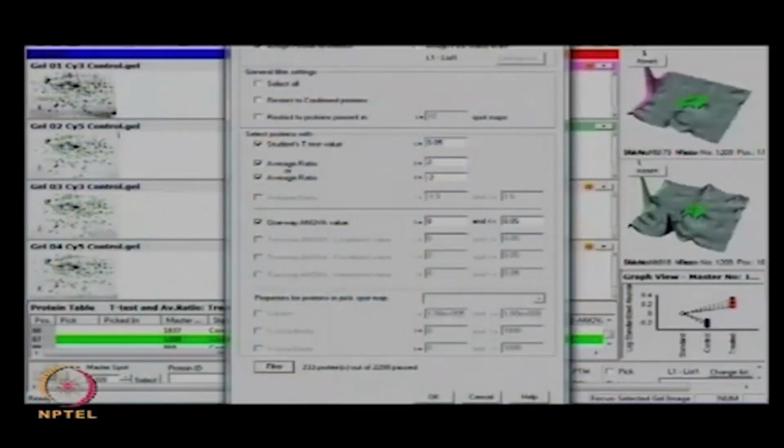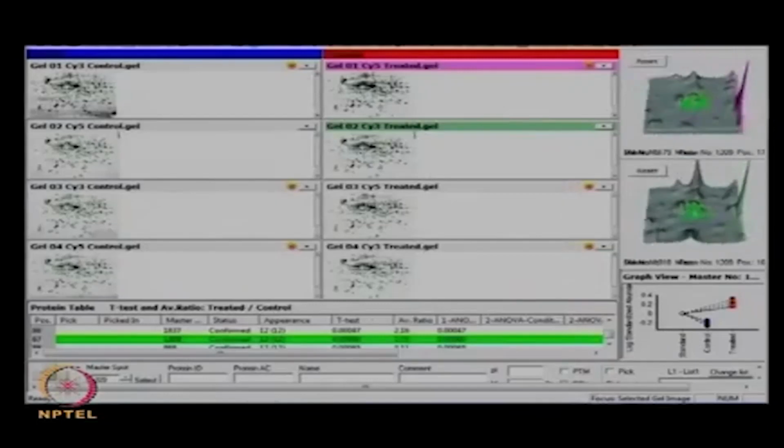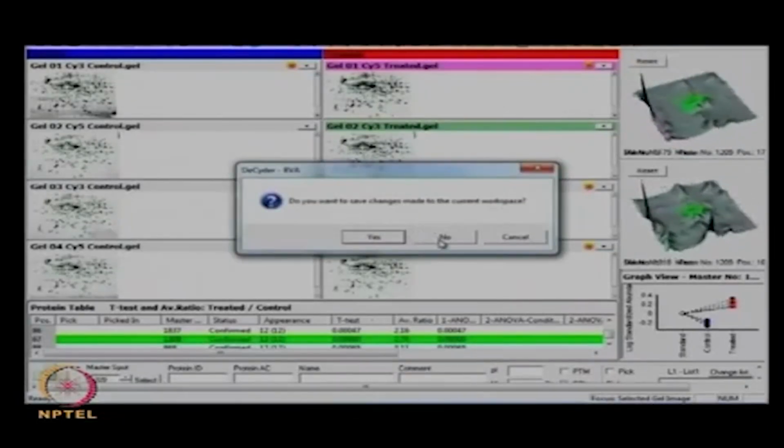So, if I understood correctly, the statistical parameters will probably be more stringent in EDA, and you can have better biological significance information from the data set. Exactly. Because in a lot of clinical data or different types of treatments, people like to do several gels and a lot of treatments. Yes. So your number of samples to be analyzed is very large. Exactly. And obtaining meaningful information is one of the major challenges in the whole proteomics field. So I'd like to see an EDA. Please.